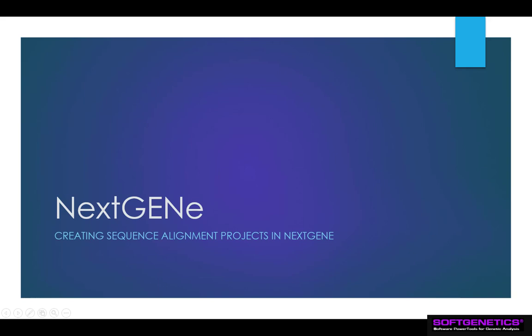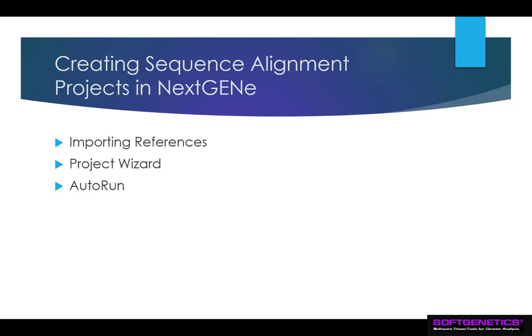Thank you for viewing this webinar on creating sequence alignment projects in NextGENE software. We'll discuss importing references and setting up your projects with either the NextGENE Project Wizard or the AutoRun Tool. This general workflow can apply to any sequence alignment-based application.